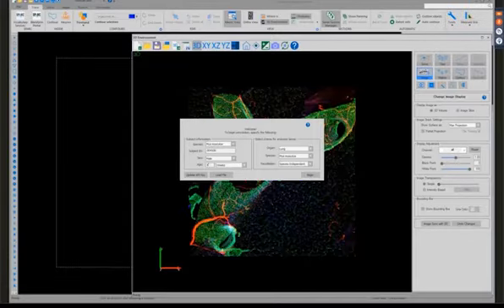The second section on the right side of the SPARC dialog is where you would choose the anatomy term list that you would like to annotate your image data with. Select the anatomical term list that is useful for your sample using the drop-down list for organ, species, and parcellation scheme or atlas. For this sample, I will select lung from the organ drop-down list. I will select mouse from the species drop-down. And the parcellation scheme, I will choose species independent because there's not currently a different atlas or parcellation scheme available for this organ.